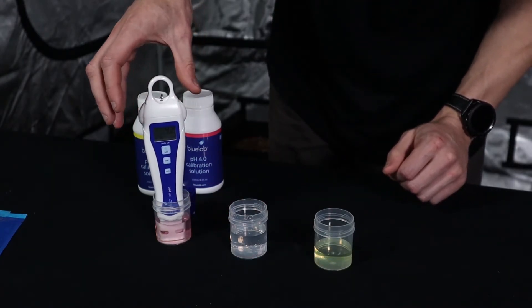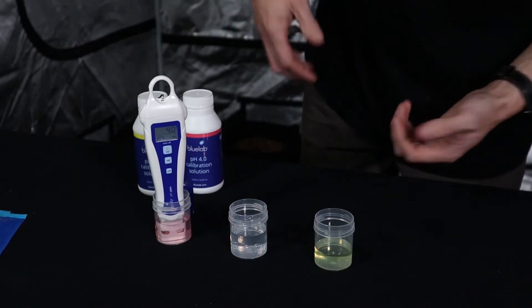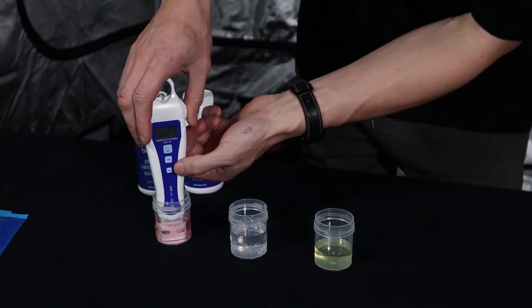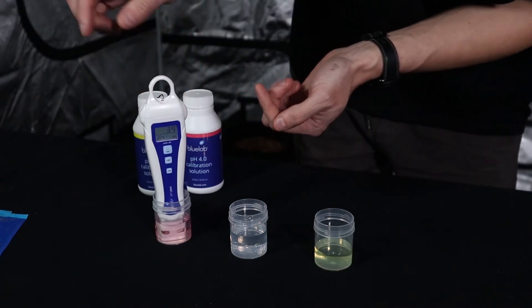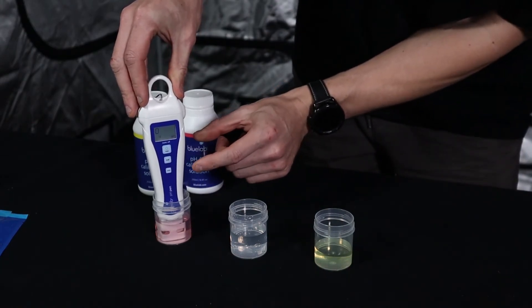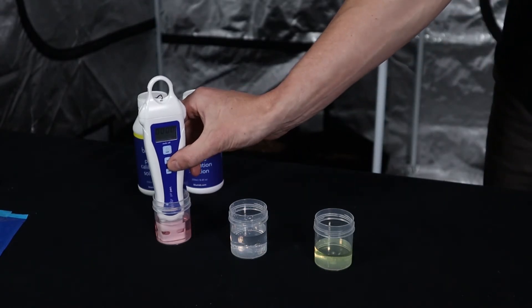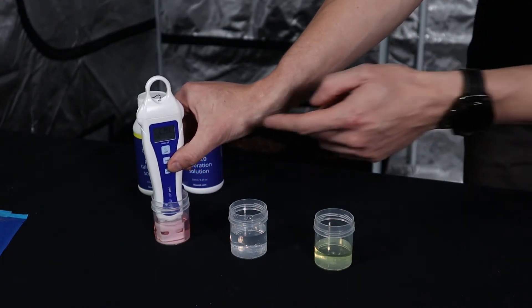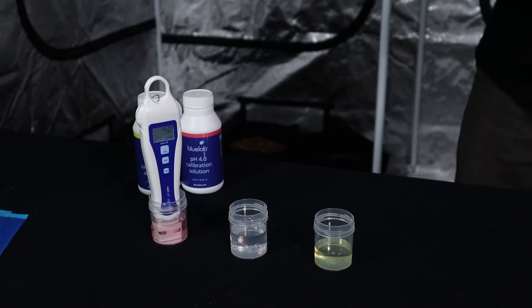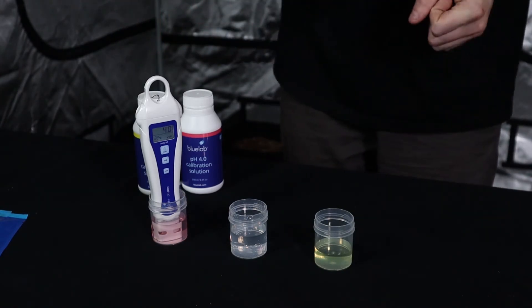Give the pen about 30 seconds in the PH4 solution to find its reading. It's measuring temperature too — about 22 degrees ambient today. The display is showing about 3.9, hovering around 4 and 3.9, which is within a point of the target — absolutely fantastic. Press and hold the Cal button again. The display will show 'Cal' and '4' for PH4, and then a little tick appears next to the PH reading, indicating the pen is fully calibrated and ready to give accurate readings.